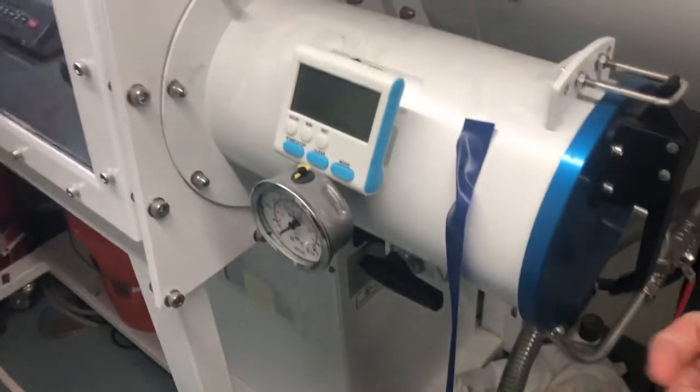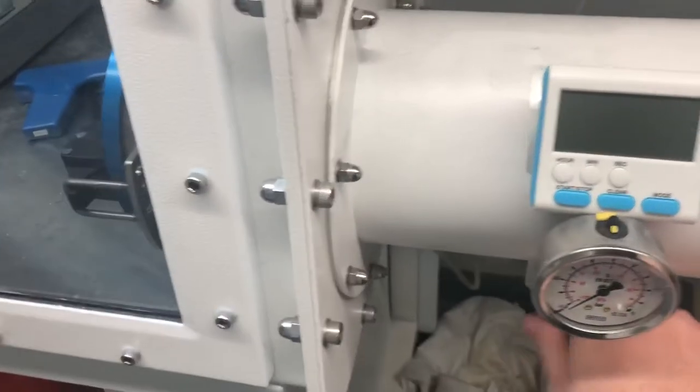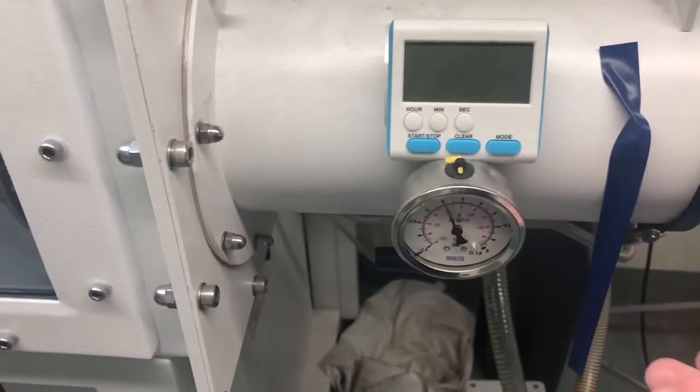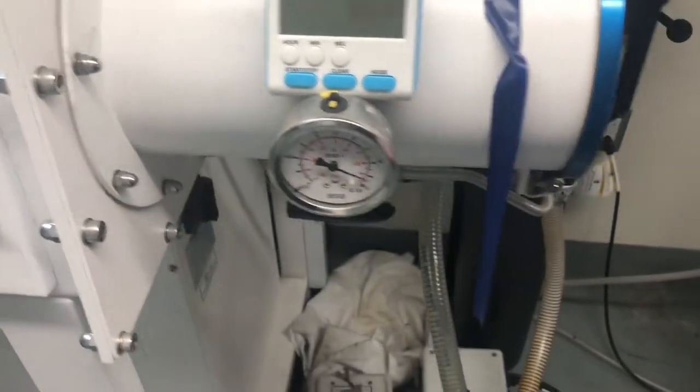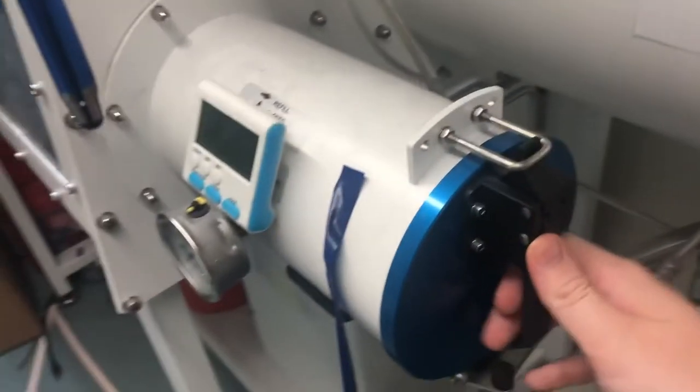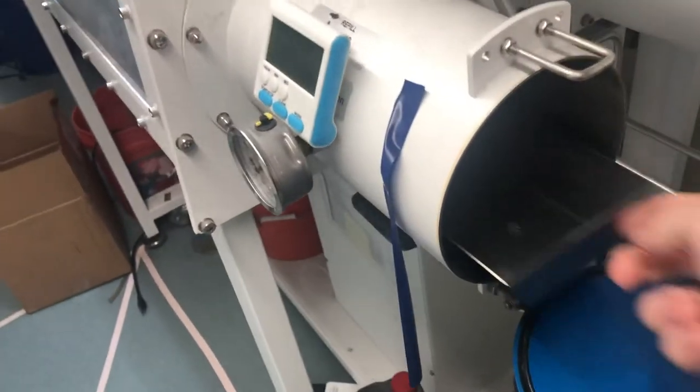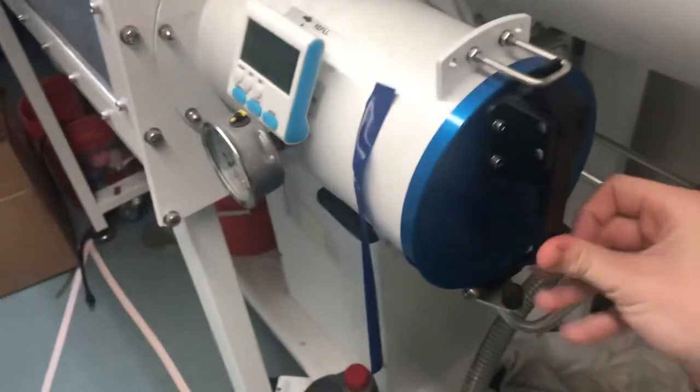You will open the chamber from this side. This will be under argon at this point. You will open the chamber from this side, take your stuff out, immediately shut it quickly, and pull vacuum again.